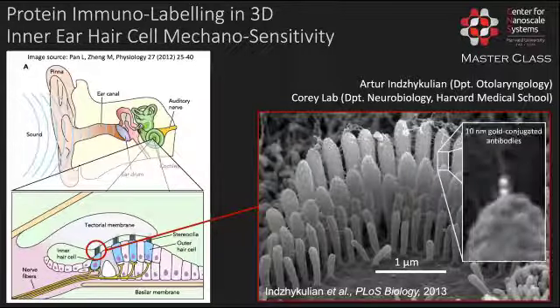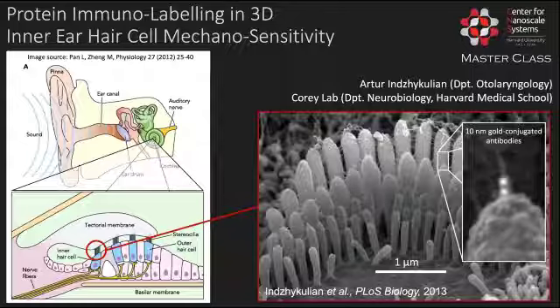Now you are going even deeper into it, and you see now very fine hairs that connect the different cilia. And so we have reached now the nanoscale, and you see here 2 bright dots, which are these gold-conjugated antibodies that have marked the position of the protein.